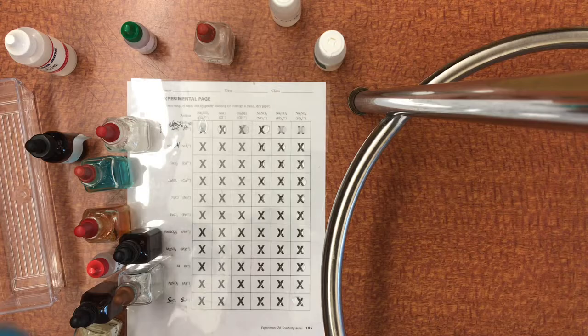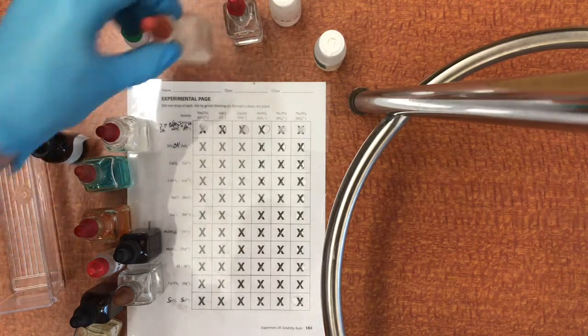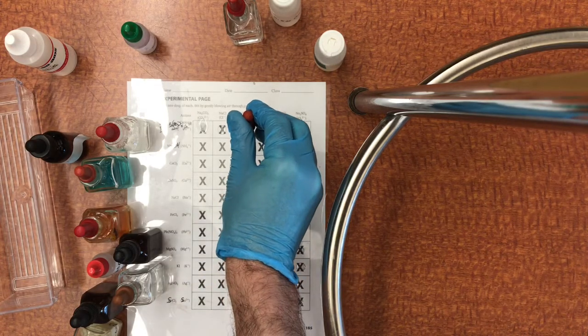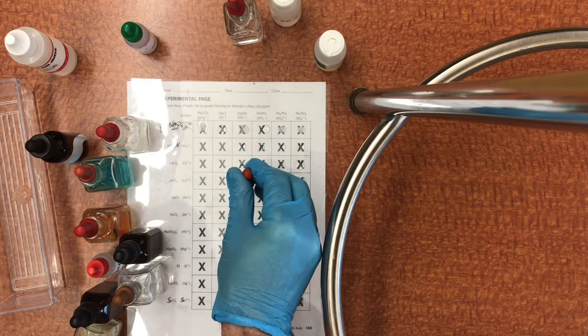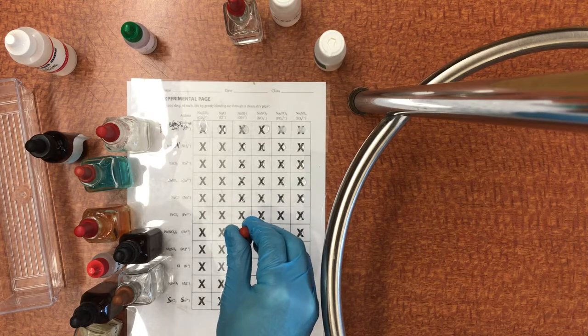If we're being really scientific about this, then we might start to worry about evaporation having an impact. This is a particularly concentrated sodium hydroxide here.